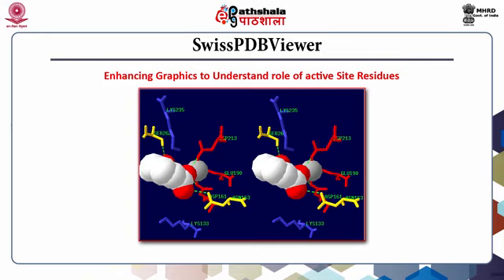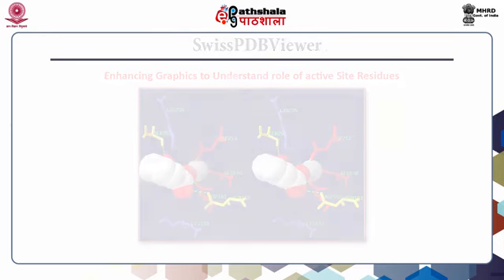In addition to these residues, 2 polar groups are involved in the binding of the OSB. This display also reveals that for the abstraction of a proton during acid-base catalysis, one lysine is above the plane of the OSB, and the other lysine is below the plane of the OSB.